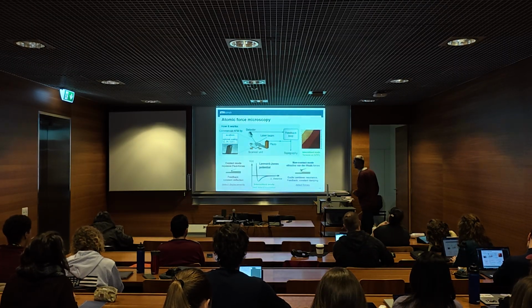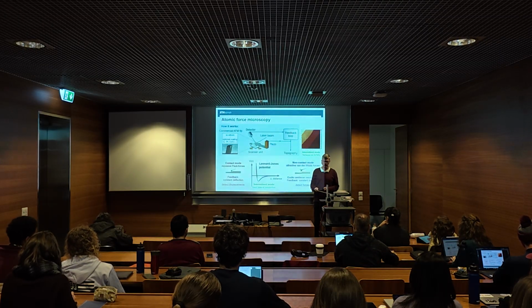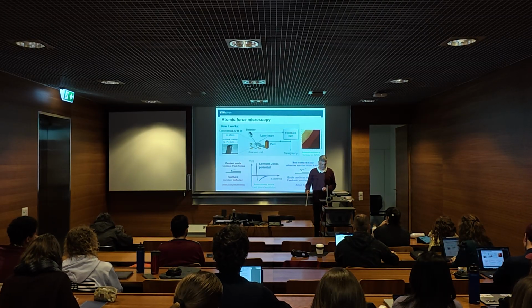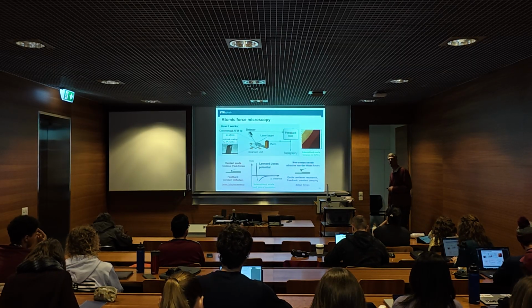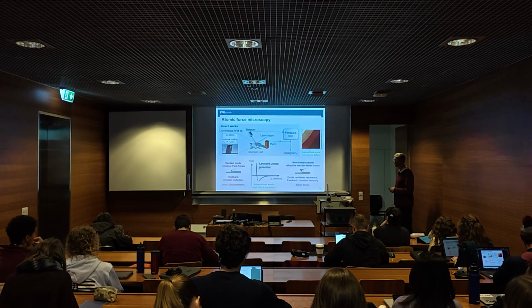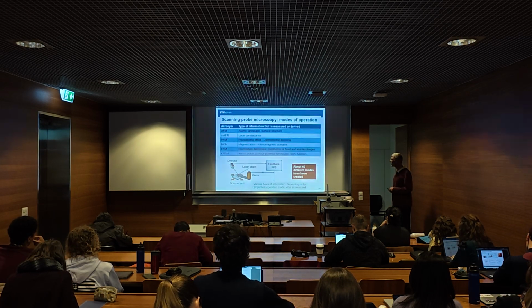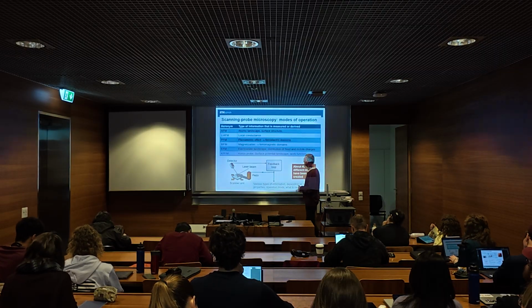In the lateral direction, you have something like down to 30 nanometers. So 30 nanometers in the plane, and downwards it is super sensitive, picometers. So basically, atomic nucleus dimensions are measured. The thing is that this is not the only mode, so you can play this in many different varieties.